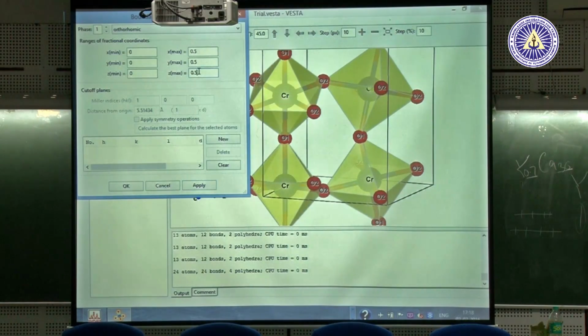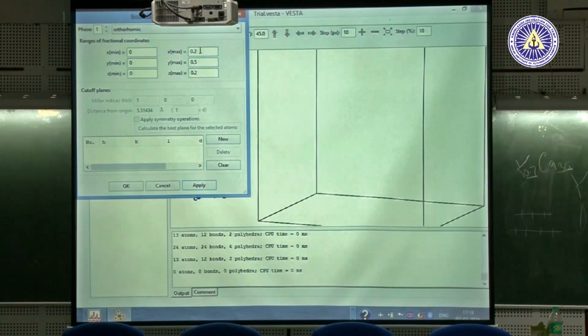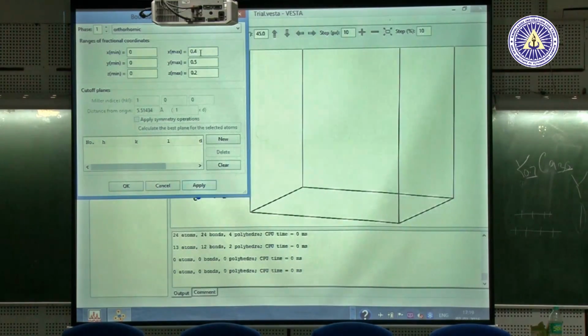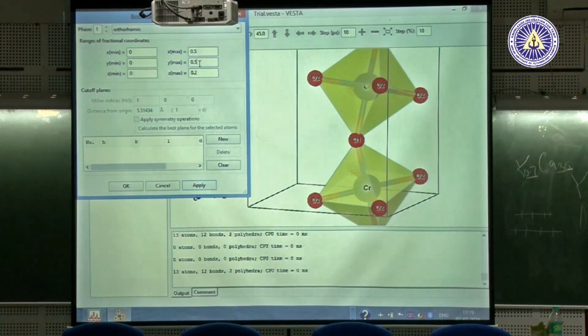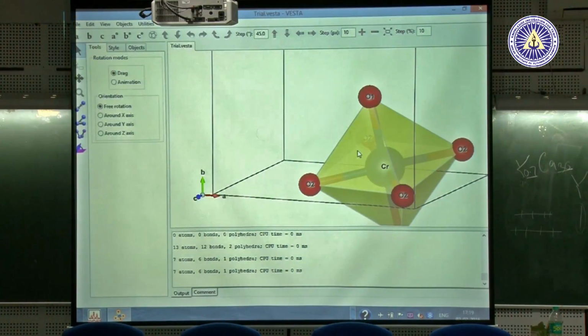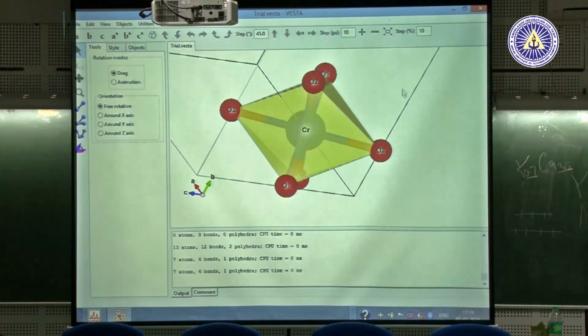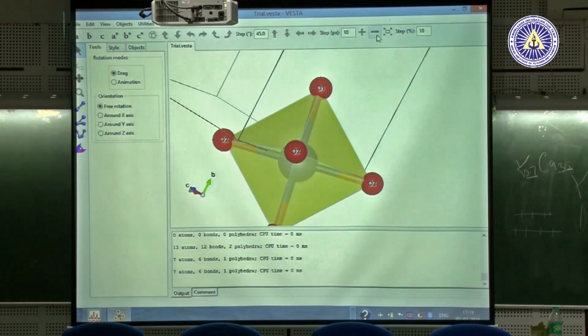I'm just thinking this may attract our undergrad students. Yes, sir. It's actually hand to hand, sir. A single polyhedra will appear, but it needs practice. It can be done. It's very easy to visualize.